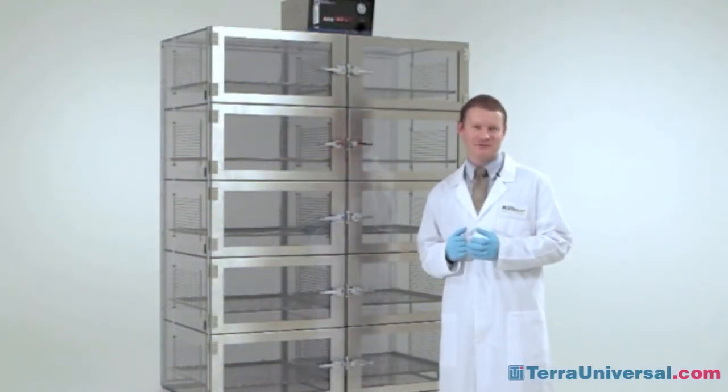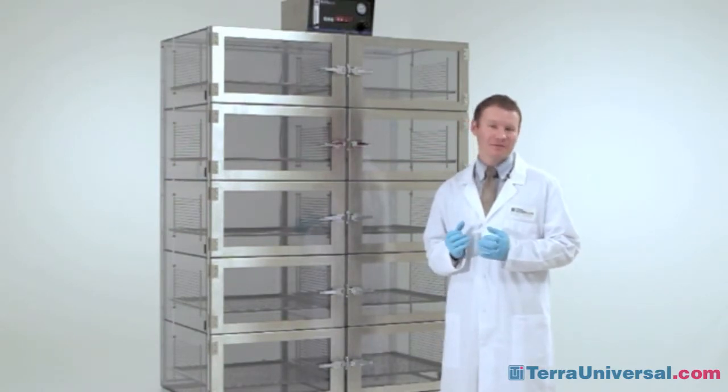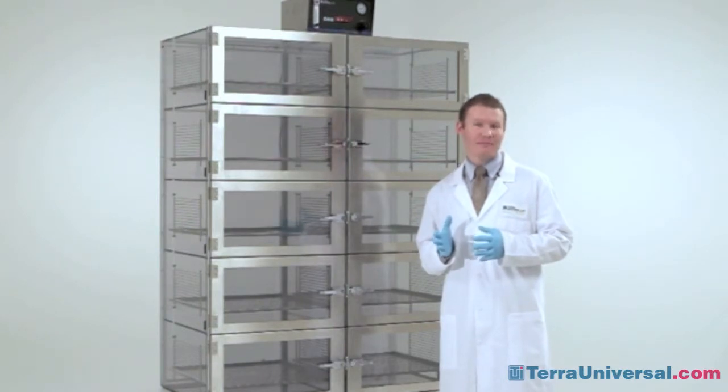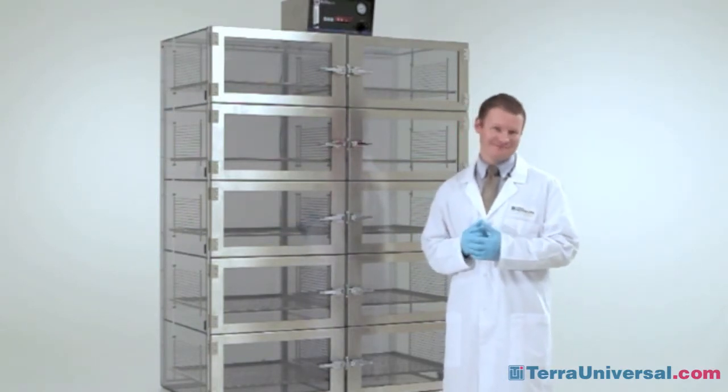Join us for future installments as we show you how to properly align your desiccator doors and properly connect and program your dual purge nitro watch system. See you then!